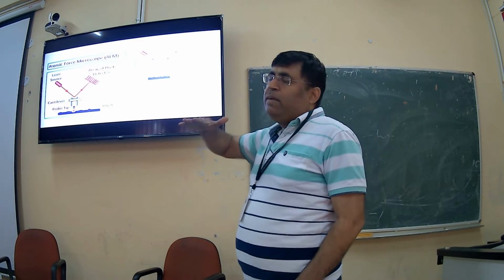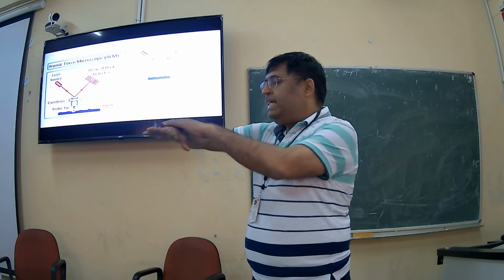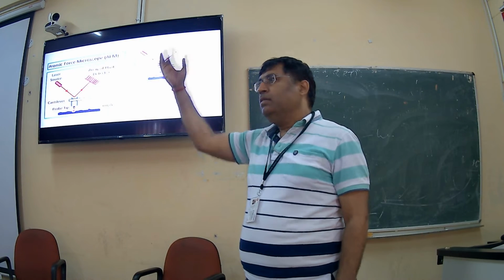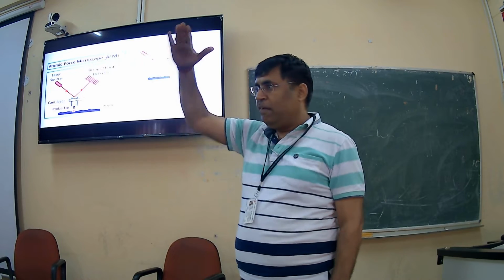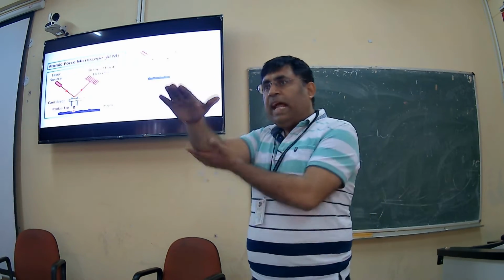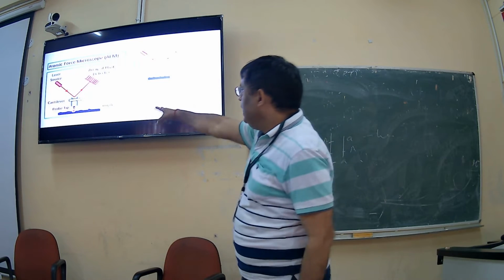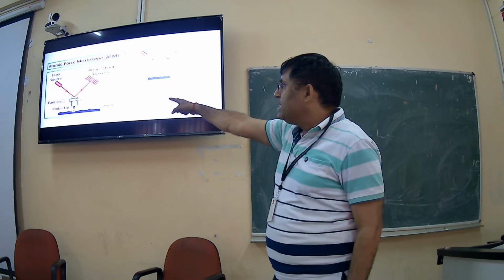The probe is a little bit different. How is the probe? This is one cantilever. So a cantilever looks like, let's say in a swimming pool, when someone jumps, the diving board: the jumper first bounces two or three times and then jumps. Have you ever seen that? So that is a kind of cantilever which can move up and down, and then you attach a probe there. Here you can see this is a cantilever, and then you attach the probe.